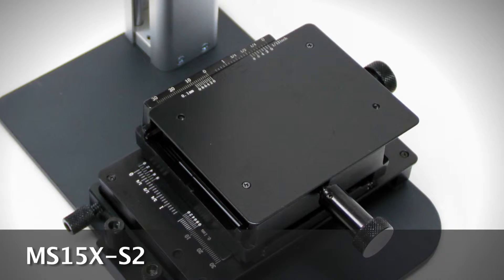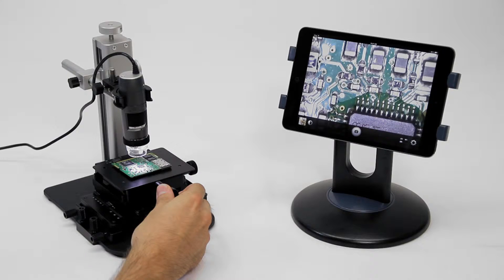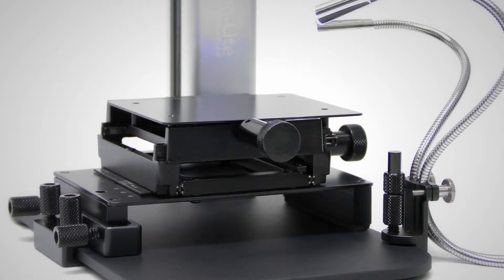The MS-15X S2 XY base with rotating stage includes an additional clamp to secure the base to Dynolite stands such as the MS-35B, MS-36B, and RK-10A.